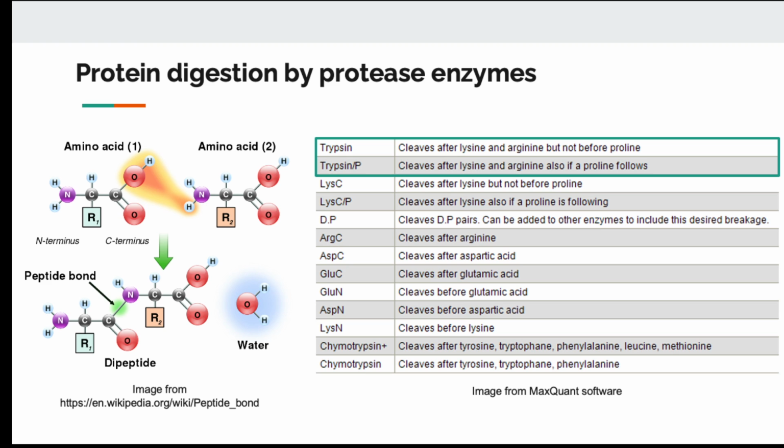When we want to study protein, you will see later on that if we analyze intact protein as a whole, because proteins are quite large, the spectrum that we are going to get will be complex. So usually if you want to identify the protein, we can do concepts similar to DNA sequencing.